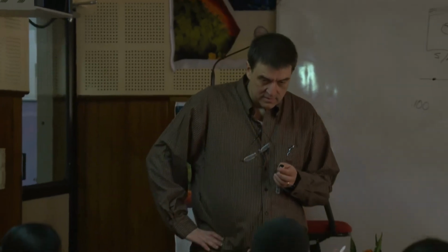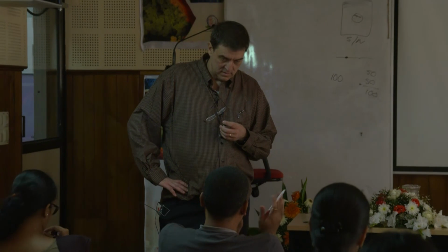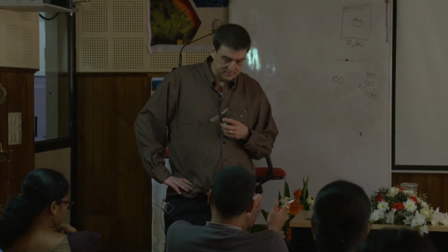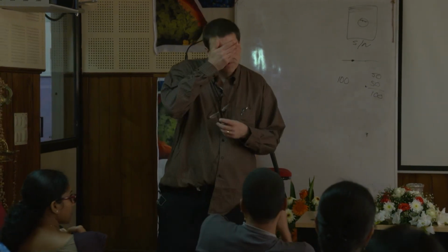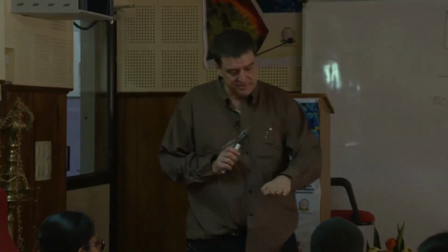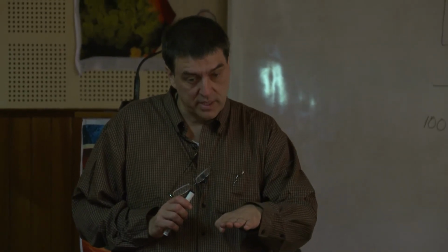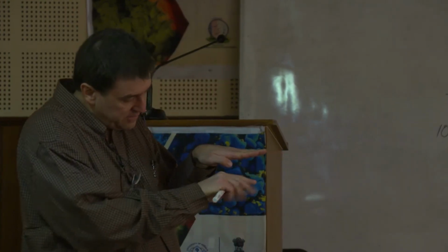If we want to look specifically at particular planes, you said we can focus on that area. How can we choose that area specifically in all the cells? Okay, so what you do when you actually get on the scope is you pick what they call a top. You're focusing on your cell, and you focus up and up until it starts to become blurry. So then you're out of focus, and you call that the top. Then you focus, focus, focus. You see your cell in focus. Then eventually you get to a spot where it's blurry again.